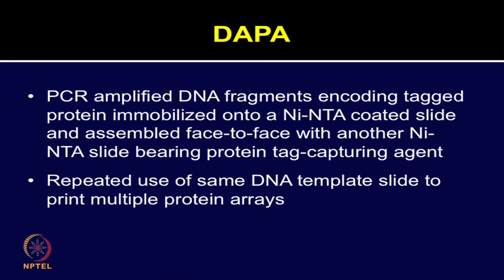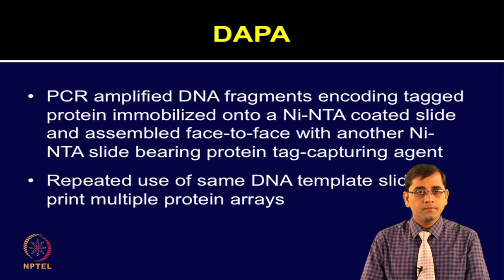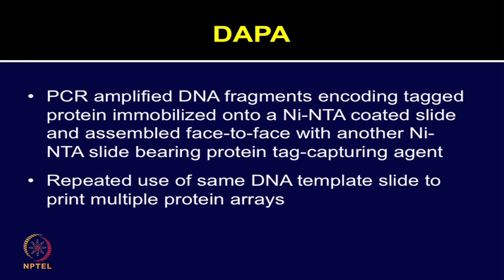In DAPA, the PCR amplified DNA fragments which encode tag proteins are immobilized onto a nickel NTA coated slide and assembled face to face with another nickel NTA slide bearing protein tag capturing agent. The repeated use of the same DNA template can be performed here and multiple protein arrays can be generated.